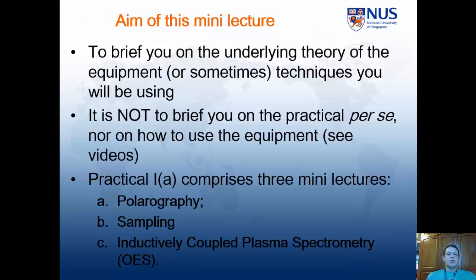As for all of these lectures, I need to underline what the aim of the lecture actually is. What we're doing here is we are briefing you on the underlying theory of the equipment that you're using and occasionally the techniques you're using. So in this lecture we could talk about just atomic spectroscopy, but you're particularly using ICP-OES, so that's what we're going to concentrate on.